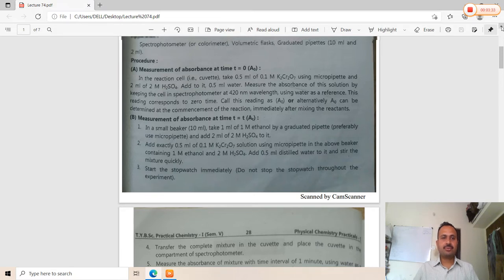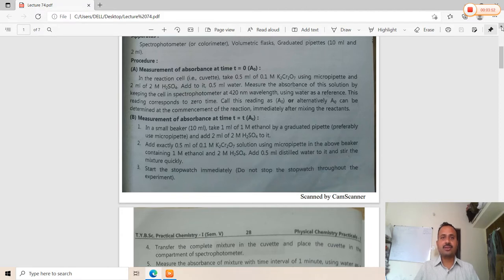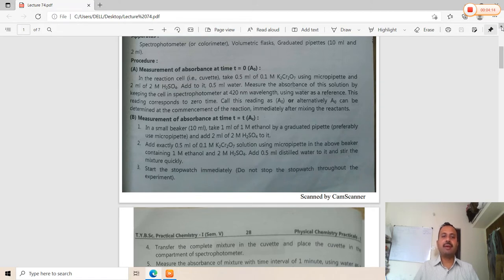Procedure — measurement of absorbance at time zero: Standardize the colorimeter or spectrophotometer using sulfuric acid or water as a blank reference, setting 0% absorbance and 100% transmittance. In the cuvette, add 0.5 ml of 0.1 molar potassium dichromate using a micropipette, 2 ml of sulfuric acid, and 0.5 ml of water. Measure the absorbance at 420 nanometer wavelength using water as a reference. This reading corresponds to zero time, called A₀.